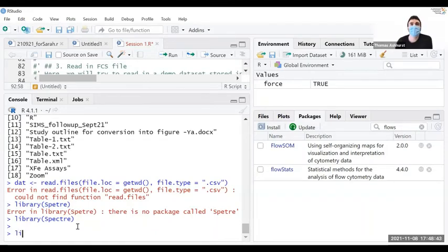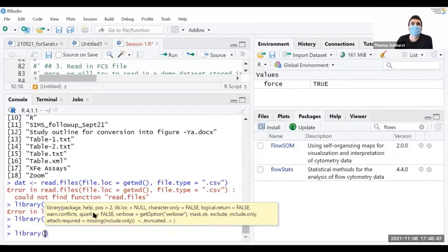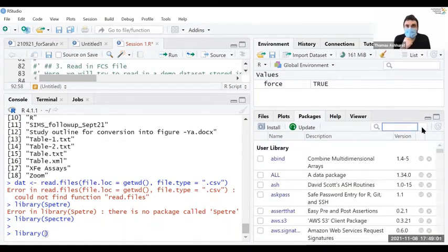So when you're in the console, you can click. Also, try running the read files. Yeah, run it again. I think he meant run the read files again. Yeah, if the library is now loaded, probably the easiest way is you can just take the script from the top again. Actually, there's two things you can do.